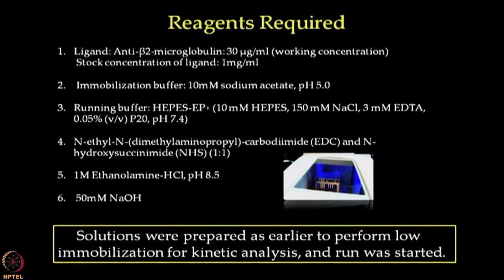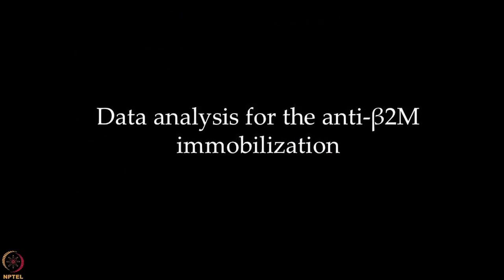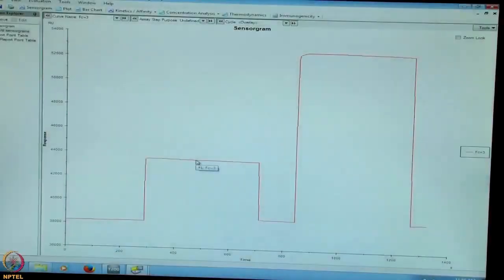We prepared the above mentioned solutions, transferred them to appropriate sample vials, placed them in the suitable rack, and started the immobilization run as we did in lecture 33. To save time, we shall now proceed directly to analyze the data obtained from immobilization of beta-2 microglobulin antibody. So this is a blank sensorgram.